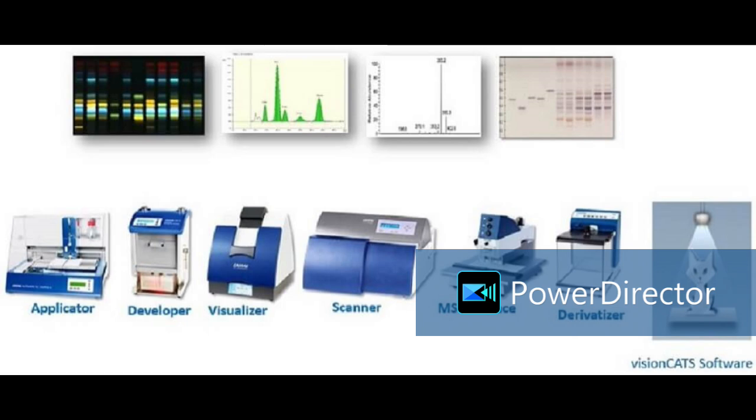HPTLC has to be done well first. See, always the chromatographic separation should be proper. Then only can you focus on a particular band. If bands are merging, then TLC-MS will not be effective. If the bands are separated properly with method development, then we can elute them and find out their mass.